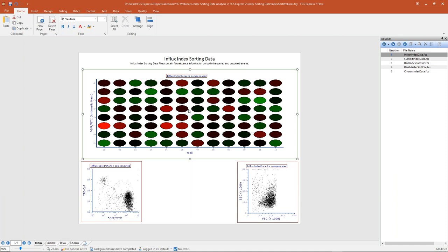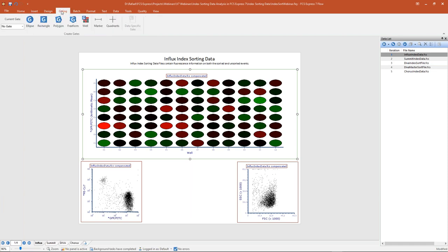This will let us see where those sorted events fall in relation to my non-sorted events using backgating onto those color dot plots. To do this, we need to create a well gate — gates specific to our plate heat maps. These well gates allow us to select different wells or groups of wells on the plate and view their contents. To add a well gate, I go up to my gating tab and in the create gate section, I'll select the create well gate button.